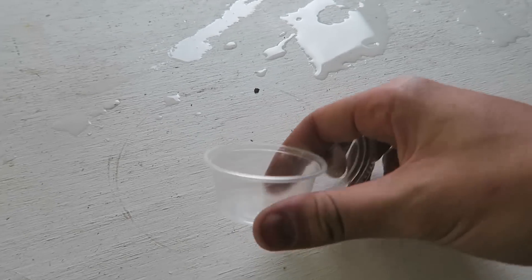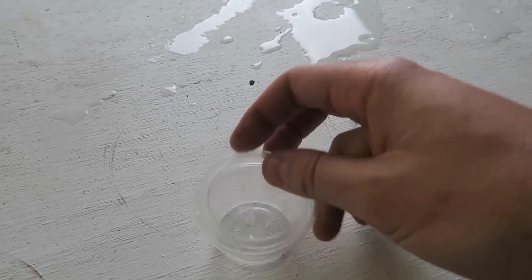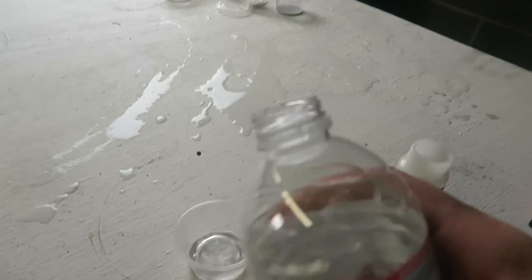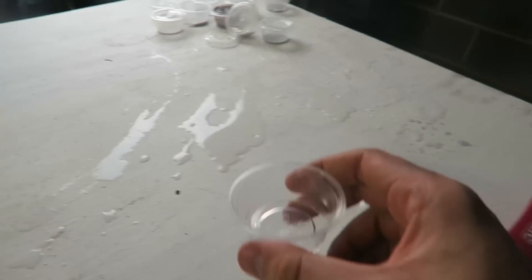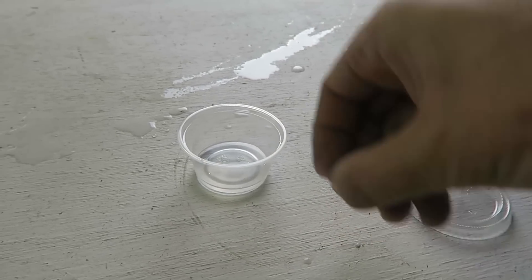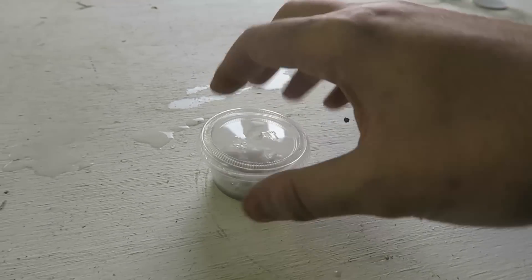So for this experiment we're going to need one of those little cups with the lid. Do not attempt to make it bigger than this. Then we're going to pour a little bit of water — we just need a drop — then we're going to throw a couple pieces inside of this cup and close it right away.